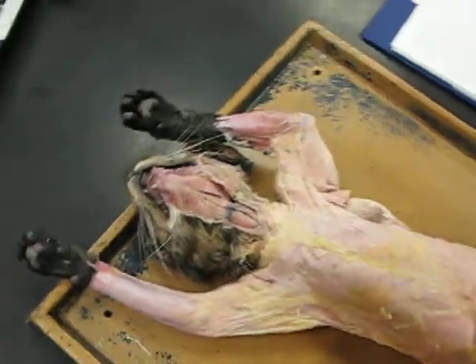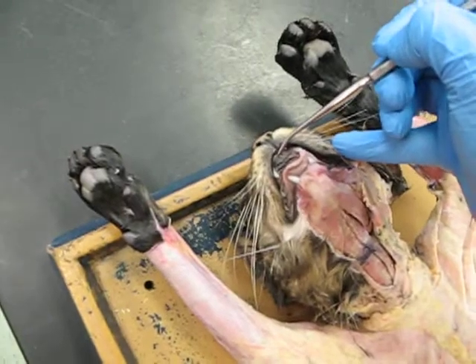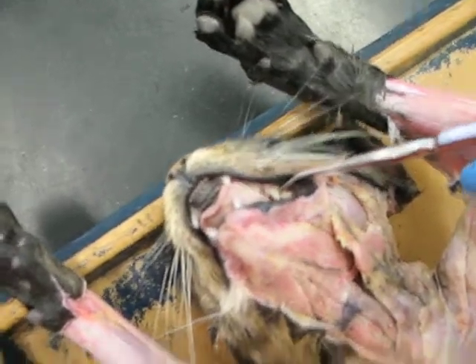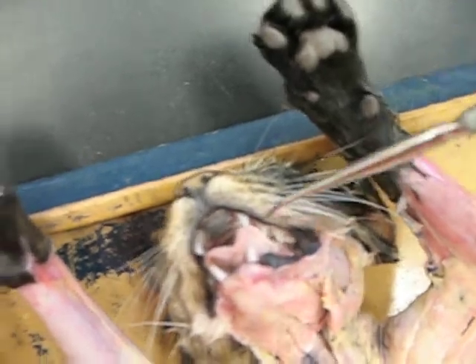Bear with me on this one as I'm having to do this one-handed. These teeth up at the top are the incisors. Here are your canines, 1 and 2. The teeth behind the canines are going to be your premolars, and in the very back, which you can't really see, but they're little teeny tiny ones, are molars.